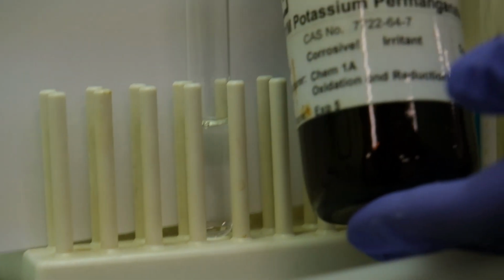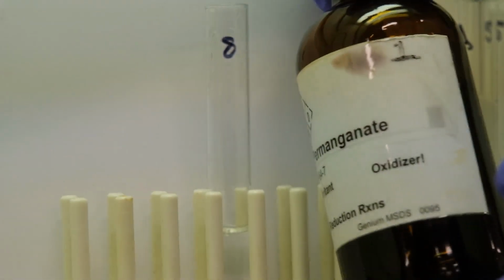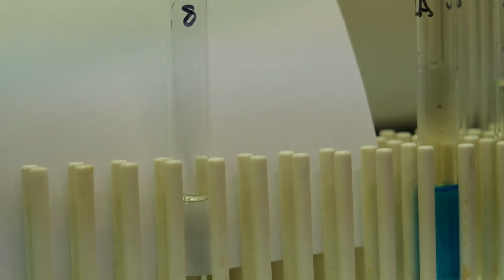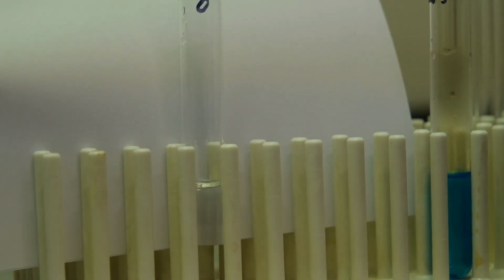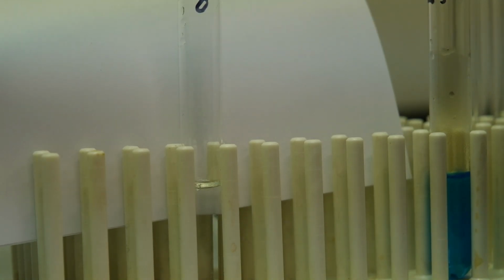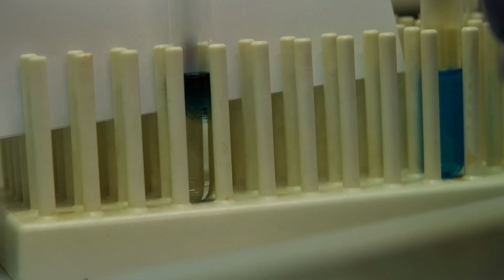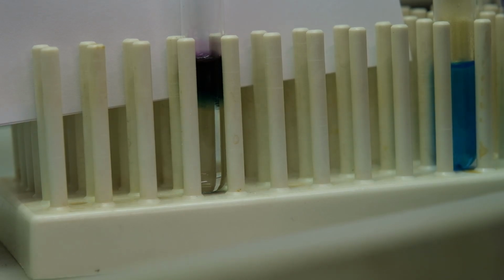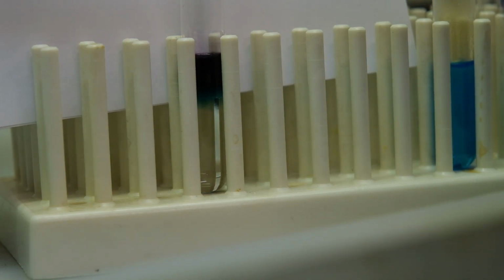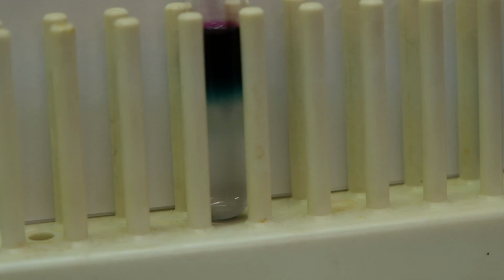And now we're going to add 10 drops of the 0.01 molar potassium permanganate. Now record any observations you see.